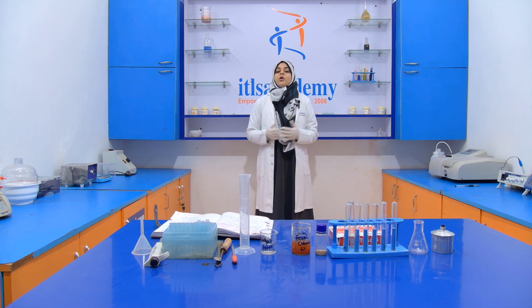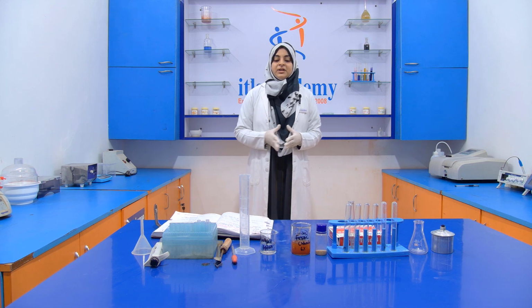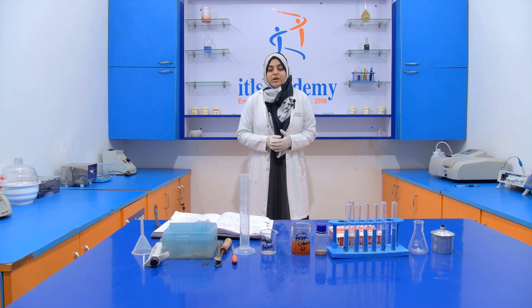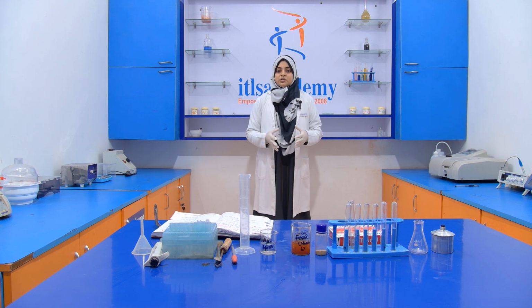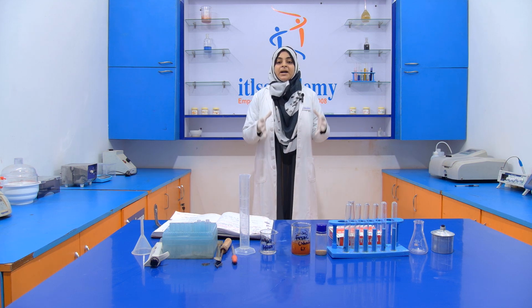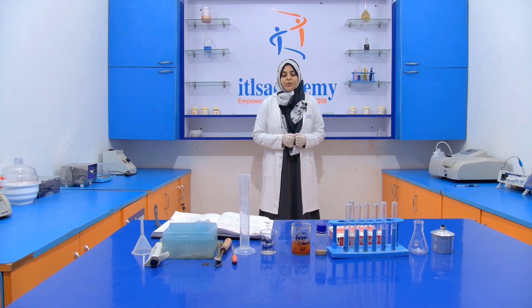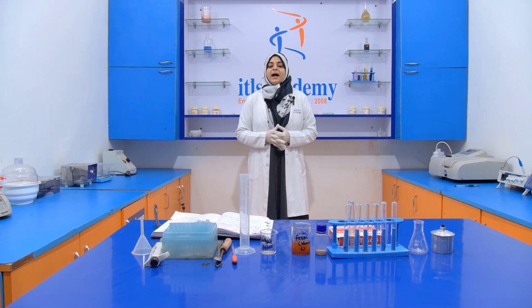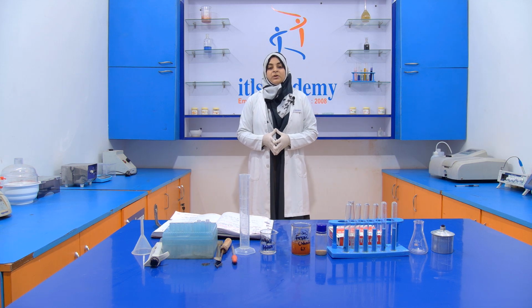We all know that adulteration is a process in which a substance is added into a food product to increase its quantity, to enhance its flavor, or to enhance its color. That is called adulteration. But ultimately the quality of that product is degraded. Quantity increases, and that's why the manufacturers add this adulterant into the food substance.